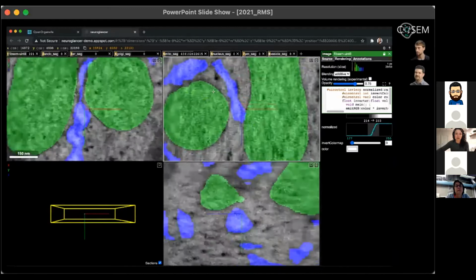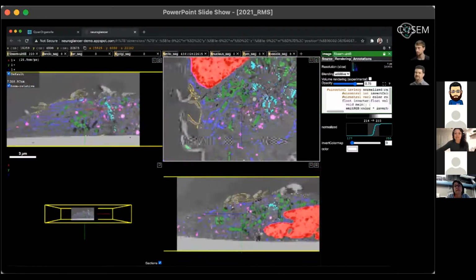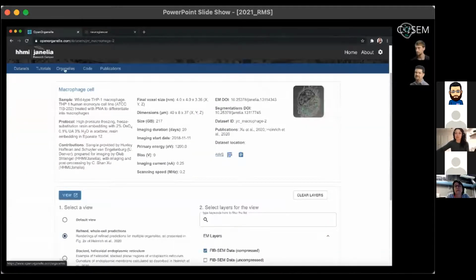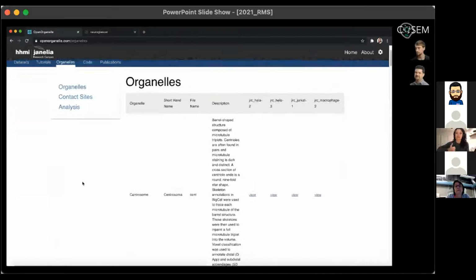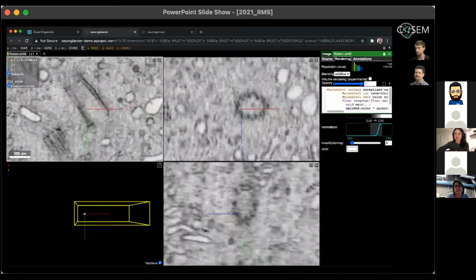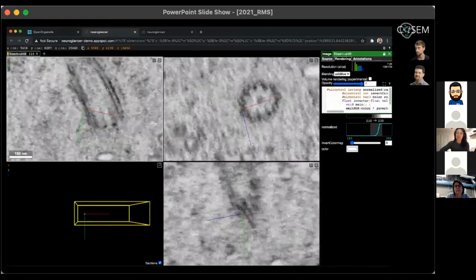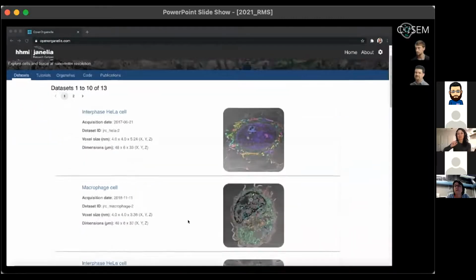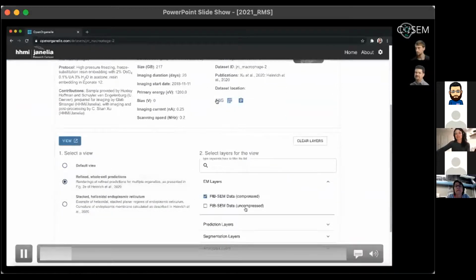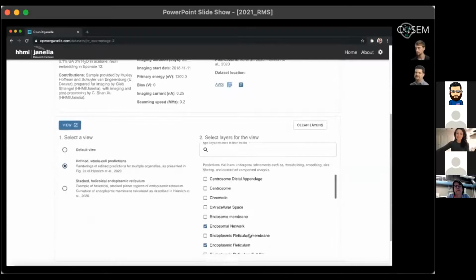So it's all made possible through Neuroglancer visualization. This data is set up in a multi-resolution pyramid schema, which allows for fast online browsing as well. And we provide tools for anyone to download any of the data or view crops of the data, however they like to, including the raw data, training data, segmentations, and the accompanying analysis. And the Saalfeld lab has also implemented N5 capabilities in Fiji. So now in the base Fiji installer, there is an N5 reader. And so you can directly read from S3, and that information is actually available here. It'll show the dataset location. You can click on the Fiji button. It'll copy that location and you can read that from your Fiji browser directly on your desktop.